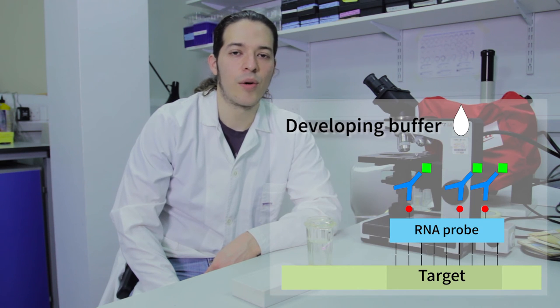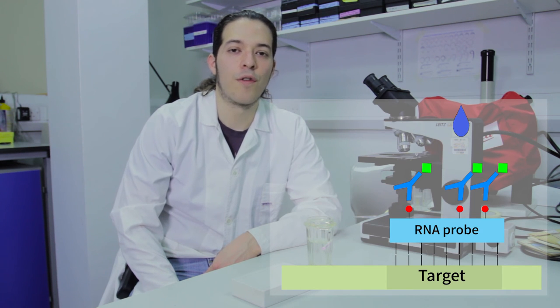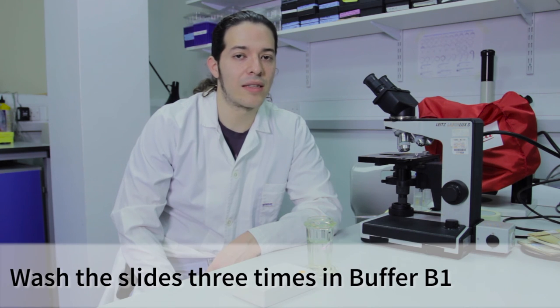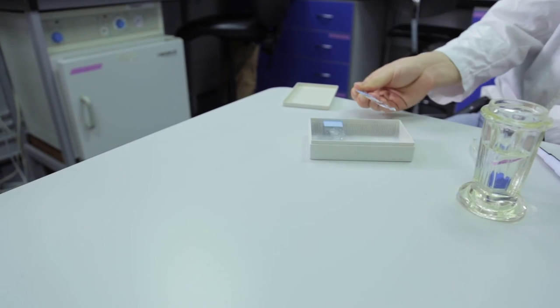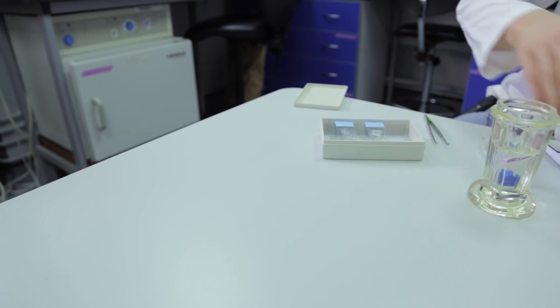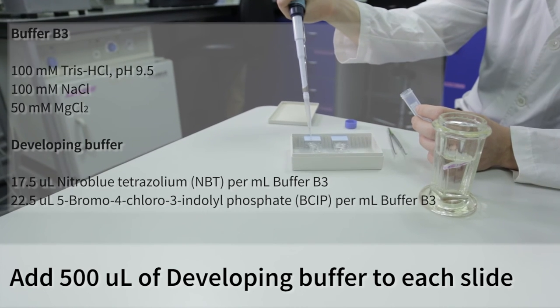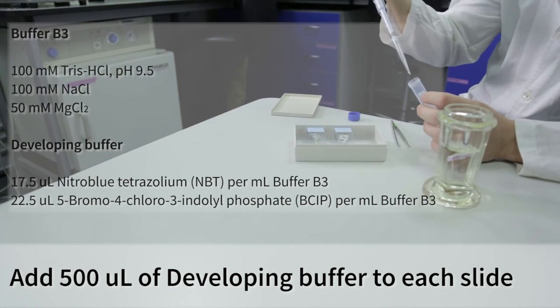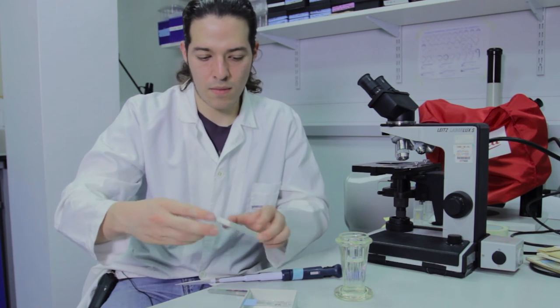During this last day, we will develop the signal. For this, we will need first to wash all the unbound antibodies to the slides. For this, we will use buffer B1 and wash the slides three times. After washing the slides, we add 500 microliters of developing buffer. I keep this in a dark container because the developing buffer is light sensitive.